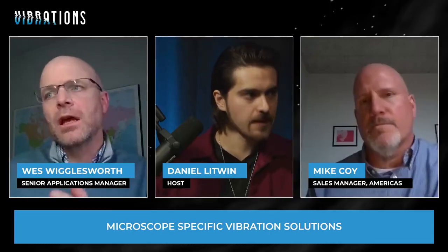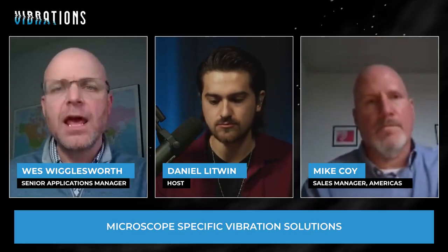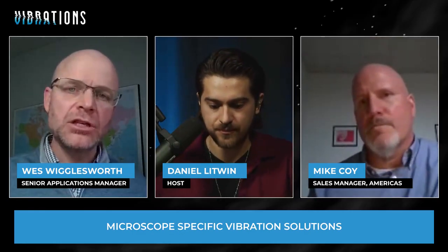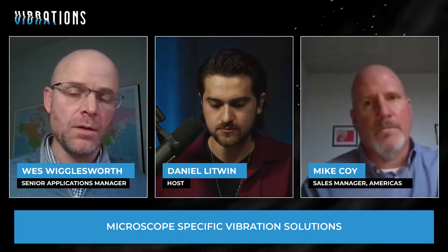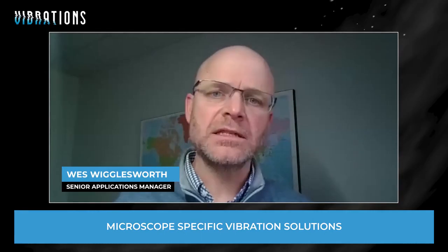So understanding what the requirements are of the microscope, that specification, and understanding the limitations or capabilities of your measuring equipment. So, for example, if you need to measure at very low frequencies and you're measuring over a very wide bandwidth out to, say, 400 hertz, well, you might not see what you need to see at 1 hertz or 2 hertz.